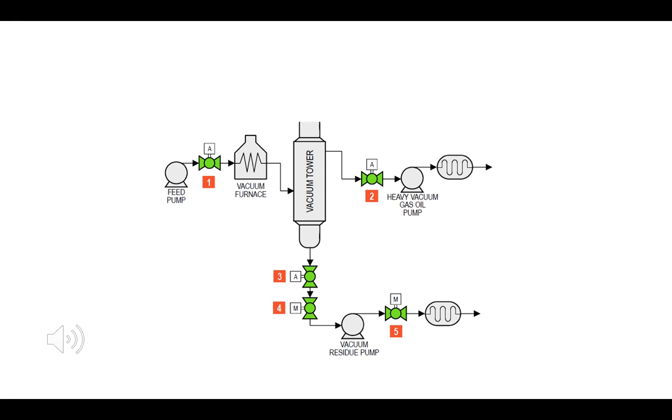Lowering the pressure below atmospheric results in lower temperature requirements to achieve the evaporation for elements to distill, so lowering the overall heat requirements of the system. Of course, there are trade-offs. When you reduce the system temperature requirements, you have to add equipment to create a vacuum instead of simple distillation. So this is great for compounds that are sensitive to heat and air, or with a very high boiling point, and the application is basically to create a vacuum to reduce the temperature at which the compound boils to protect it from decomposition, etc.